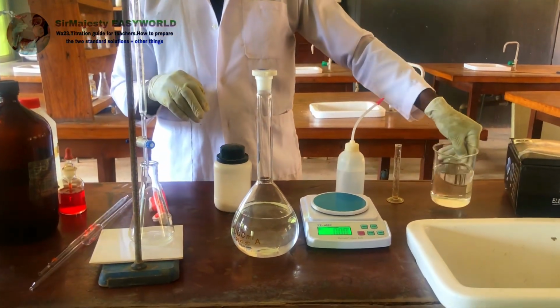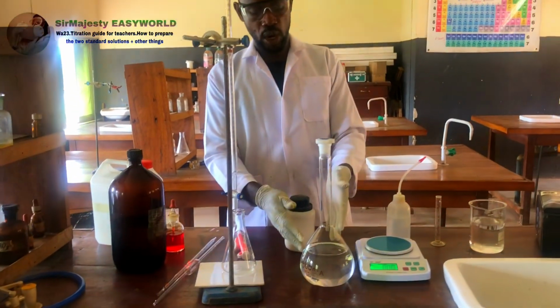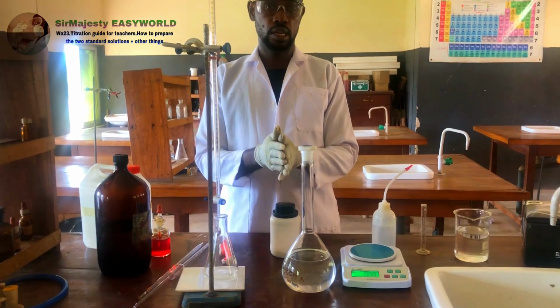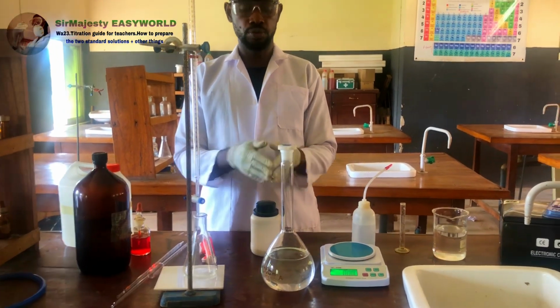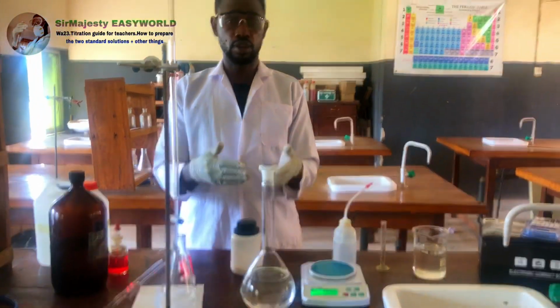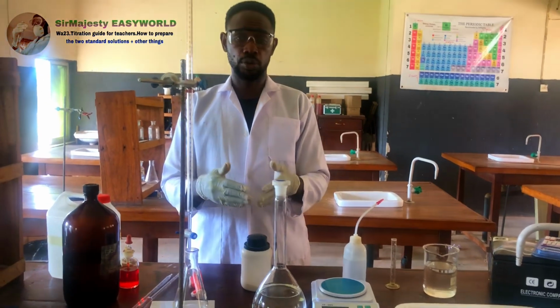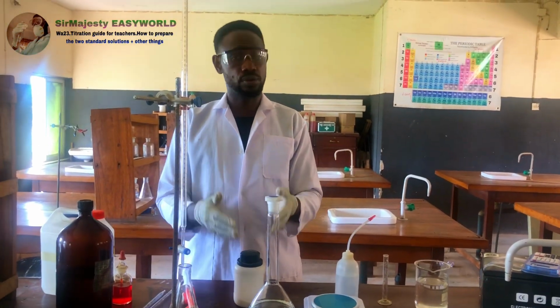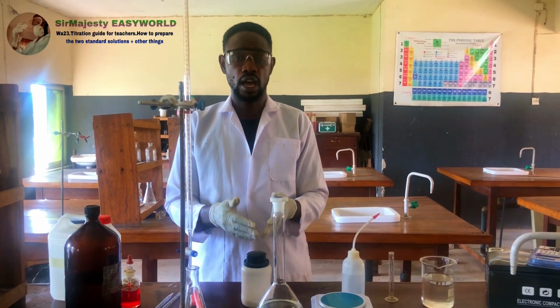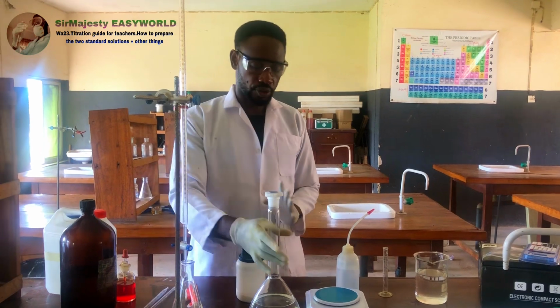So if you want to make 3 liters, this is just 1000 cc, which is 1 liter. If you want to make 3 liters, you just say 5 times 3, which is 15 grams. So you measure 3 liters of water, then measure 15 grams and dissolve, depending on the number of students you have. You are required to keep 150 cm cube of both solution A and B for each student. So you can multiply 150 ml by the number of students you have, and now know the number of liters you require to prepare. So that's it for solution B.